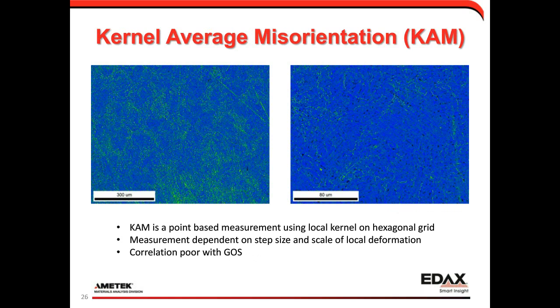We can also look at deformation on a point-to-point basis using Kernel Average Misorientation, or KAM, measuring misorientation of every point with all six neighbors — we use a hexagonal grid for six equidistant neighbors. The result is much bluer and more homogeneous than the GOS map, indicating the deformation is occurring on a larger scale than the step size here. Our precision for measuring deformation with this step size means we're not resolving things at the 600 or 200-nanometer limit, but as we look at larger grains we start to see more of the deformation present within those lath grains.